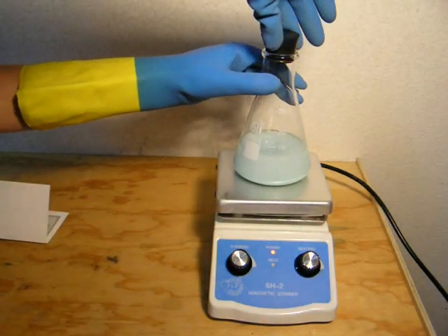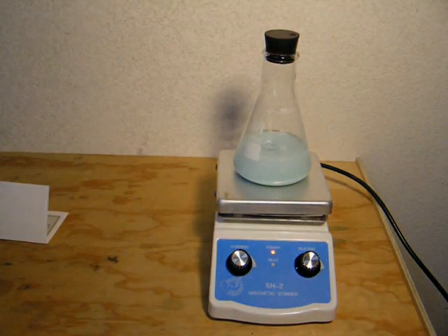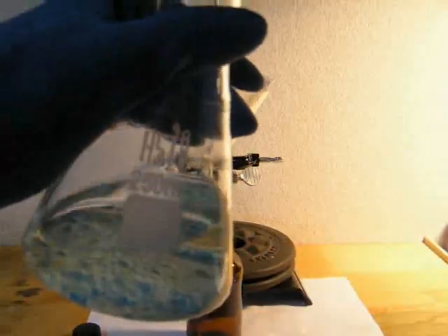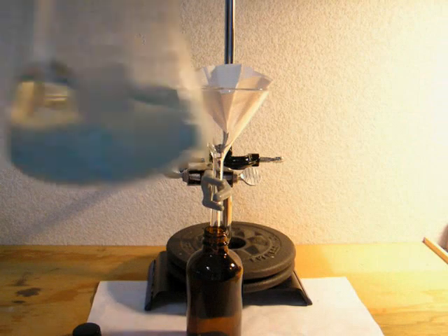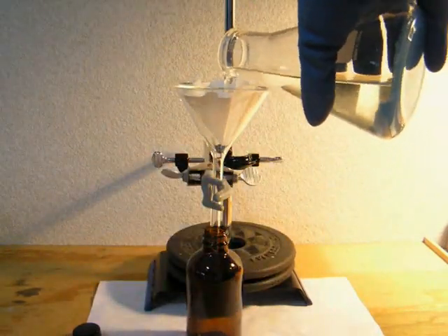Loosely stopper the flask. Now filter the ethanol into a suitable glass bottle for storage. You can see the copper sulfate has turned blue, indicating that it has absorbed water.